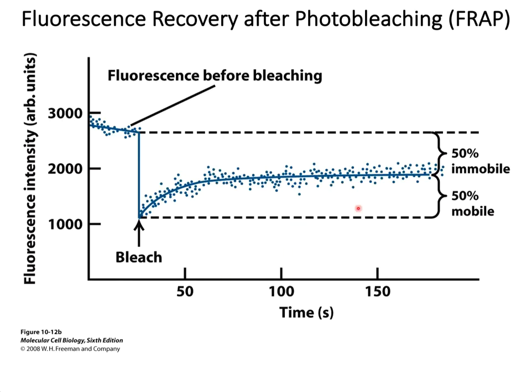There is a way to quantify the amount of fluorescence. You can collect the fluorescence intensity using arbitrary units and quantify the fluorescence from that spot. So you can see the fluorescence of that spot before it was bleached is emitting approximately 3000 fluorescence intensity units, and immediately after bleaching, the intensity drops to 1000 fluorescence intensity units, and then during recovery, about 150 seconds, it rises to about 2000 fluorescence intensity, which is about 50% fluorescence in that area.